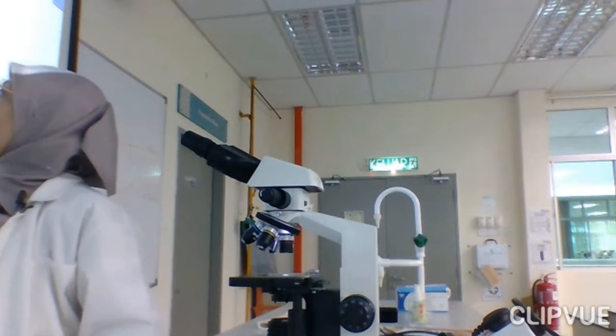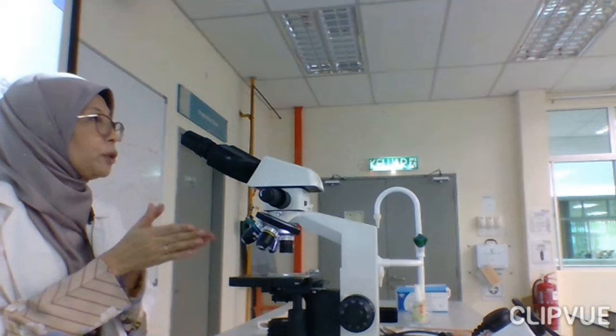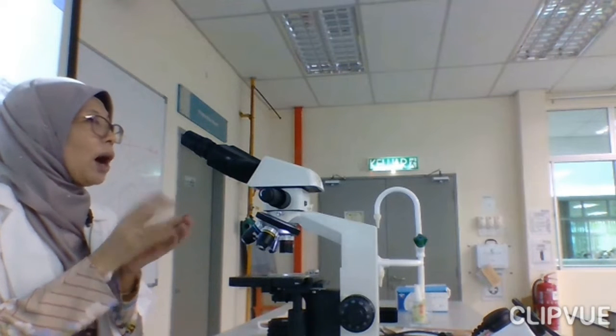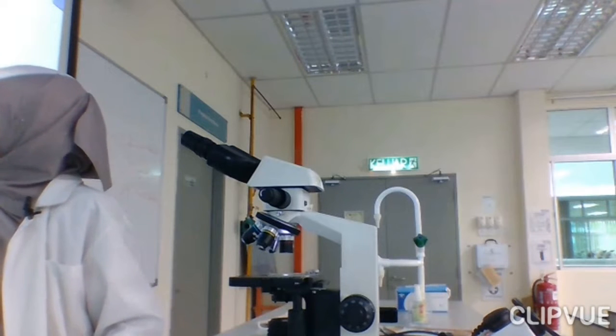Next, this one is very important to ensure that your specimen is at the center. You have to make sure that your specimen is at the center. So how are you going to make sure of that? You have to make use of these two knobs, known as the X and Y control, the Y stage and X stage control knobs over here.